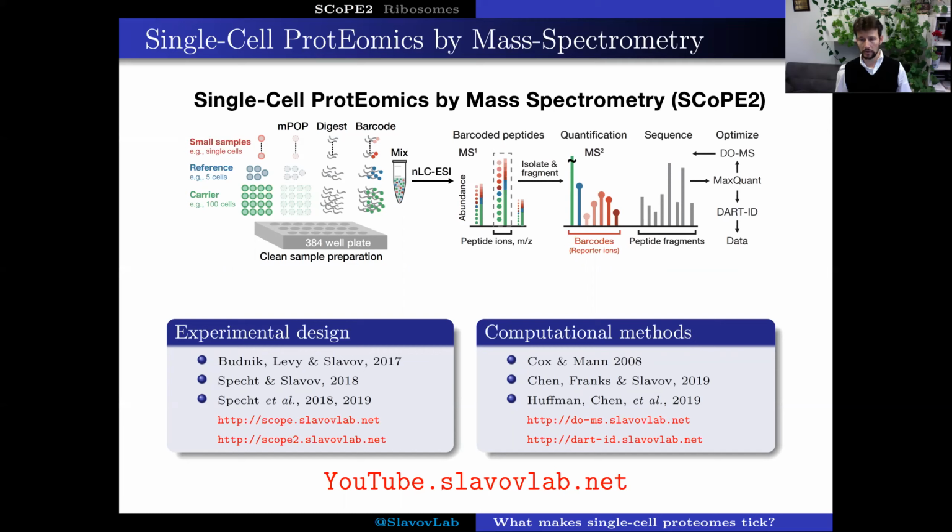We have developed the isobaric carrier concept that allows us to more efficiently identify peptide sequences and reduce the losses. I will not explain the isobaric carrier concept here due to lack of time, but you can go to our YouTube channel, as indicated here in red at the bottom, and find many videos where this concept is explained by us and others as part of the conference that I organize or presentations that I have given for our work.